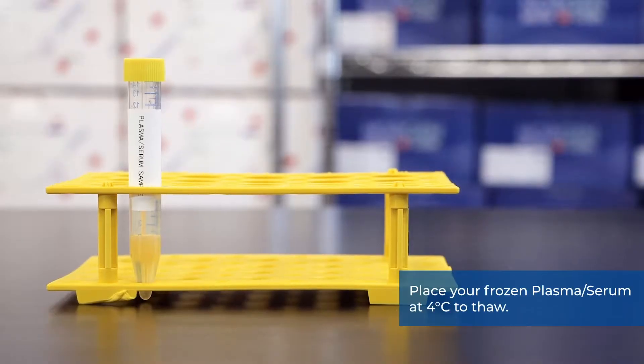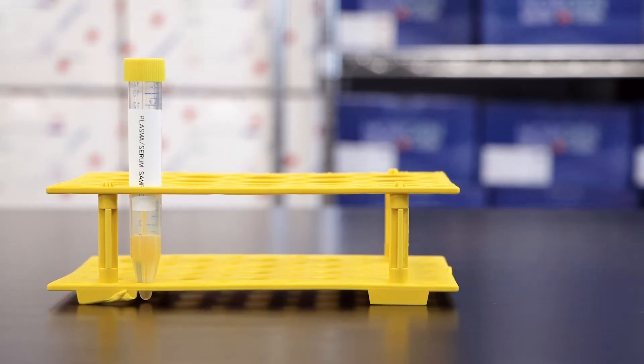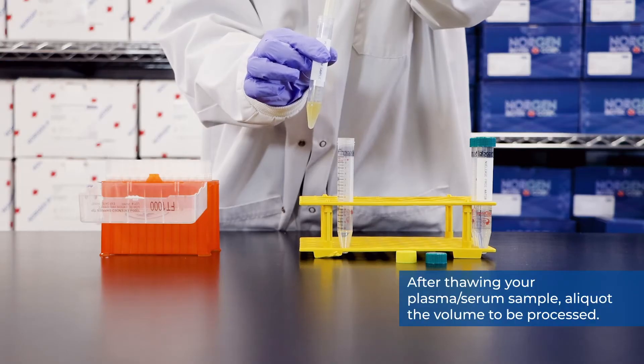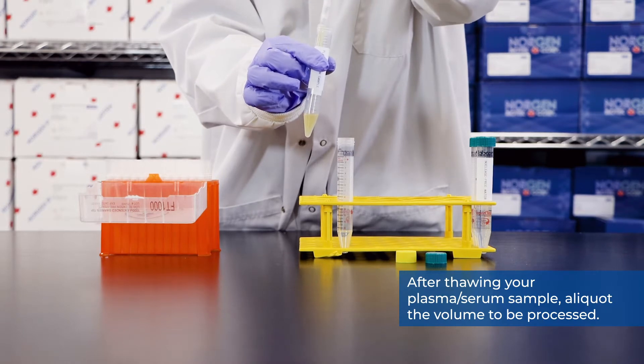To prepare your plasma serum sample, place your frozen plasma serum at 4 degrees Celsius to thaw. After thawing your plasma serum sample, aliquot the volume to be processed.